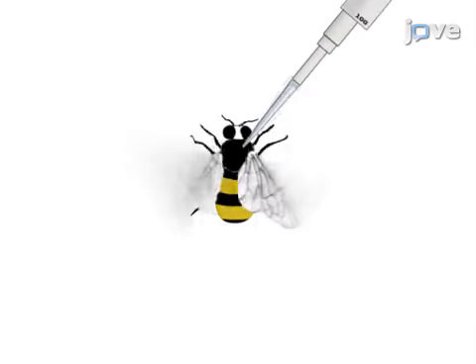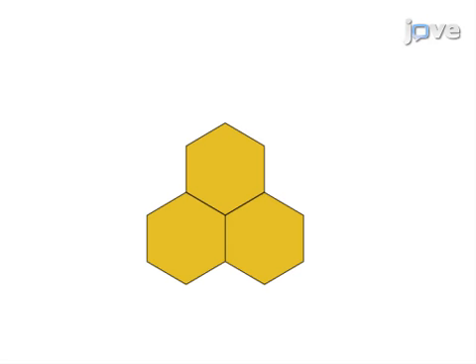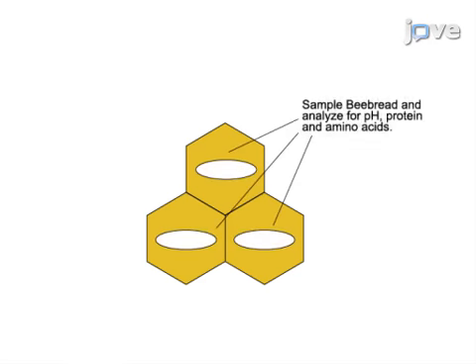Next, the bee bread is fed to newly emerged European and African bees in cages. Then, bees in the cages are sampled after 4, 7, and 11 days of feeding, and the amount of bee bread remaining in each cage is measured to estimate consumption. Finally, the concentration of nutrients, including protein and amino acids in the pollen and bee bread made by European and Africanized bees, are measured and compared between the races of bees.